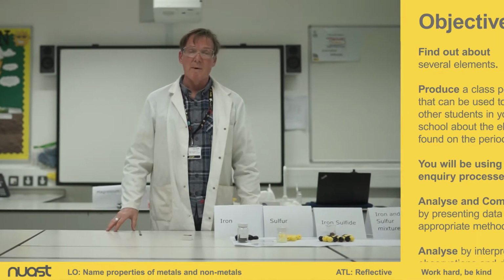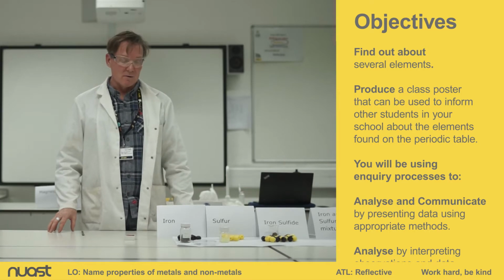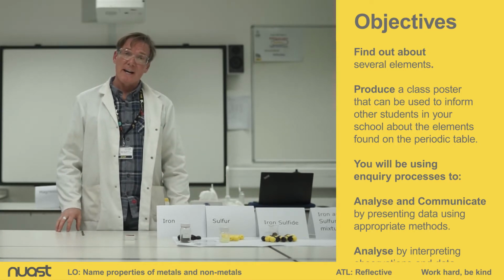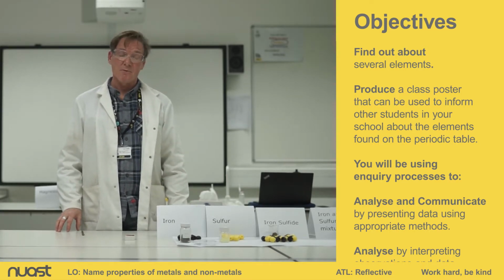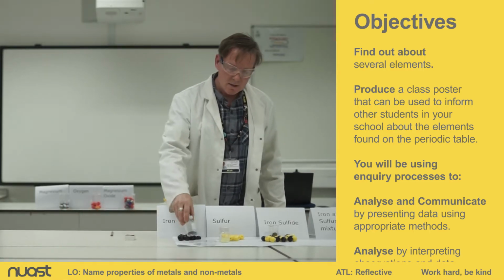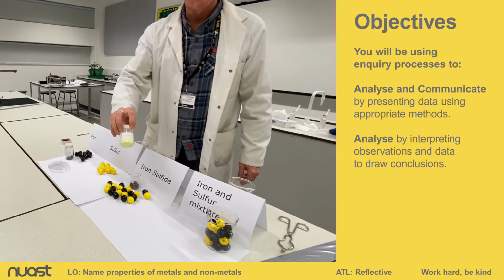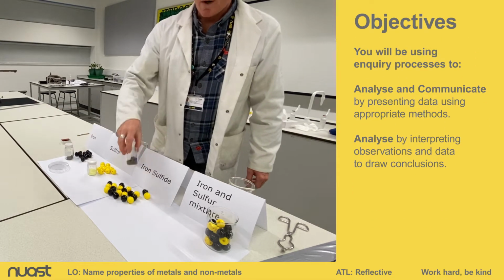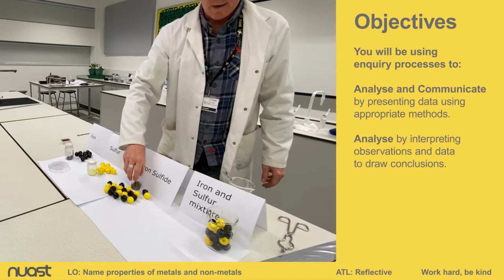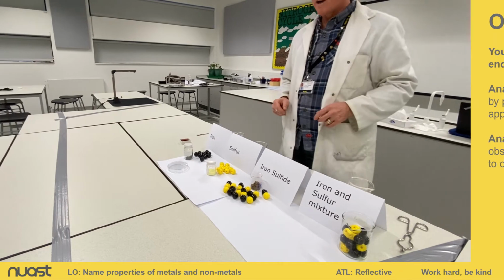I'm Dr Woodroffe. Today I'm going to talk to you about the difference between elements, mixtures and compounds. And we are looking at today 3 different substances. The substances we are looking at are iron, I have some iron filings, sulfur, some iron sulfide, and then we will look at a mixture of iron and sulfur shortly.